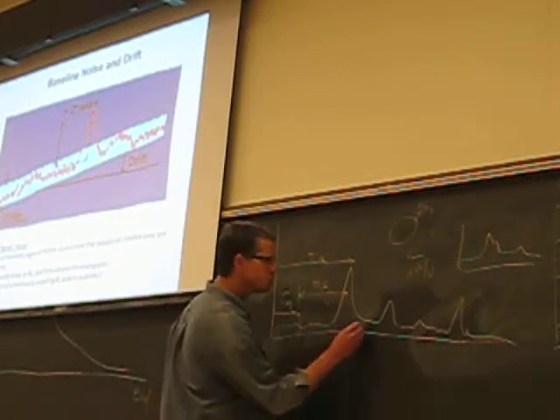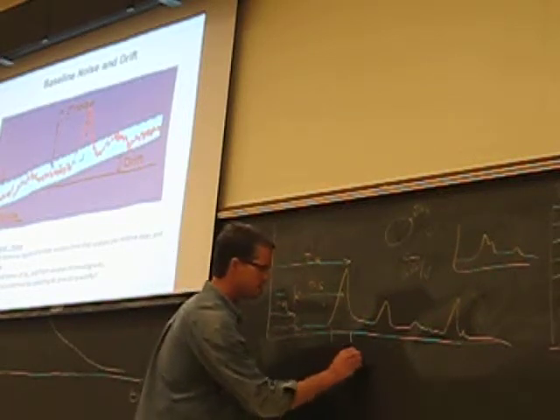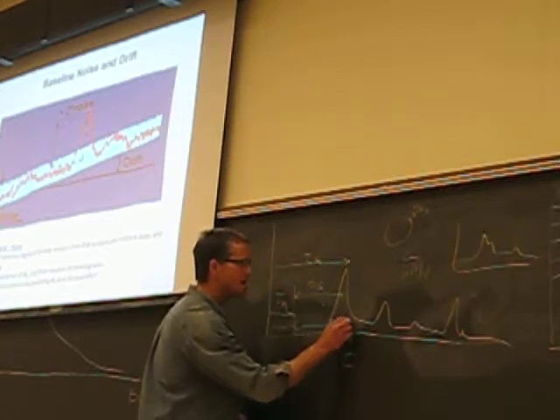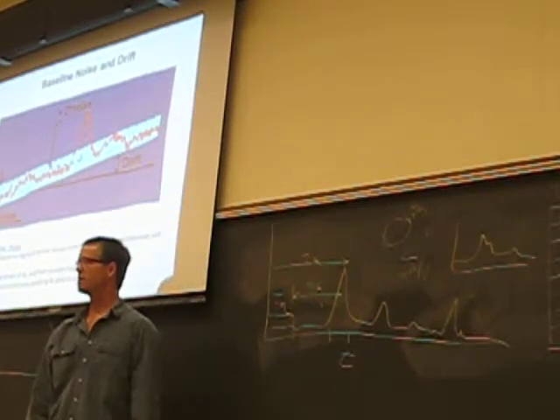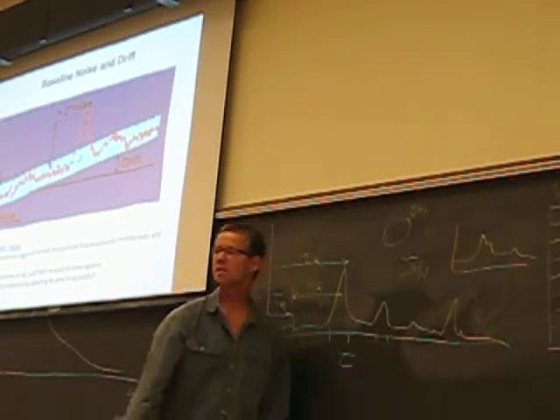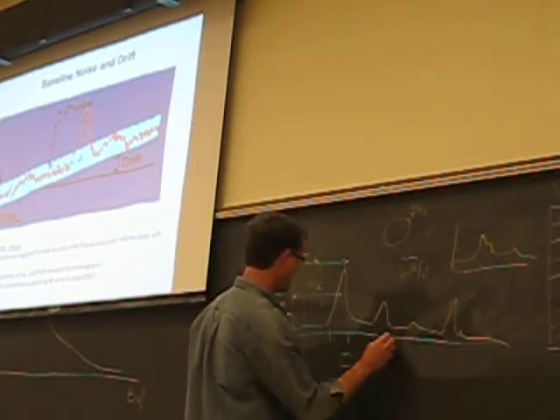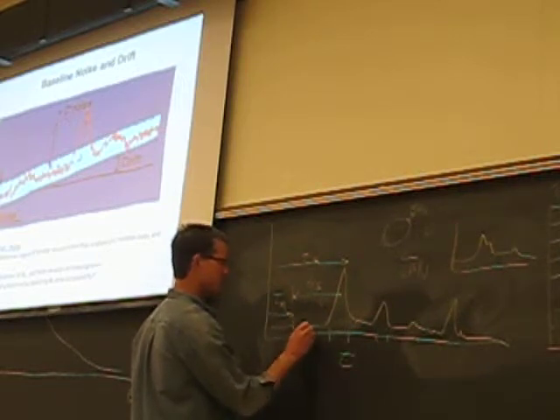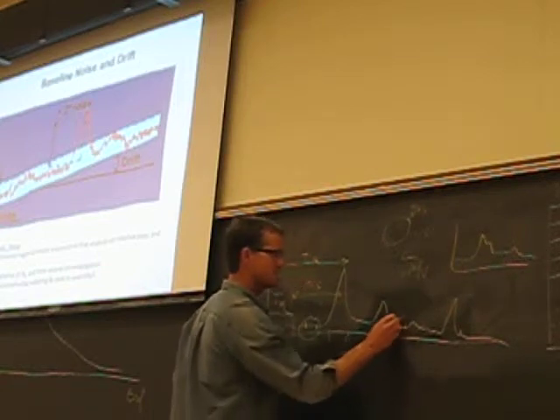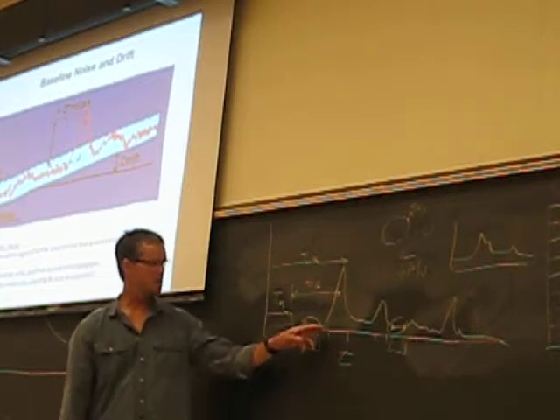And so what you have to do is say, if my peak is eluting over a time frame like this, where this is time, of course, I want to know how noisy my baseline is over a similar time area. Now, depending on the size of the peak, the time it takes to elute varies a little bit, but in your chromatogram you could pick a place where you think it's baseline, like maybe here, and maybe here and here, where it's a similar time interval over which my peaks might be eluting.